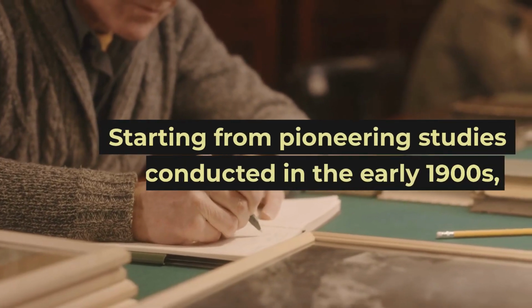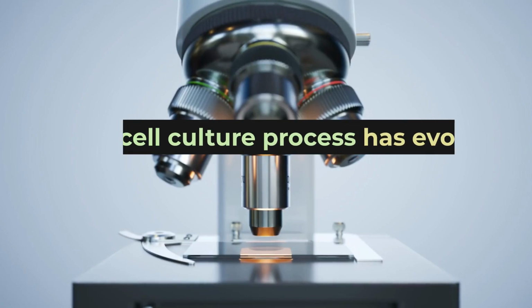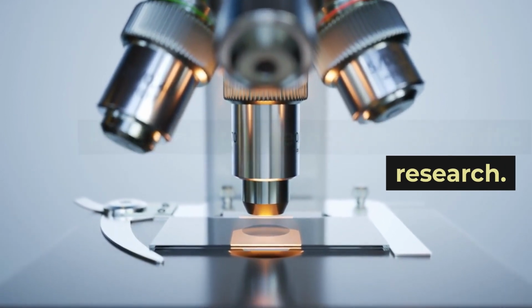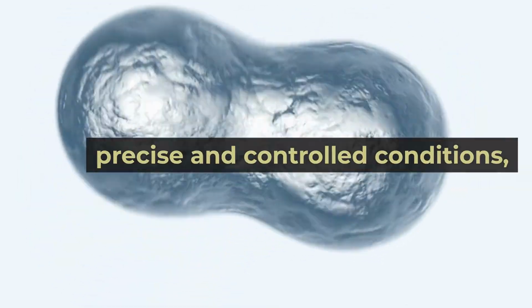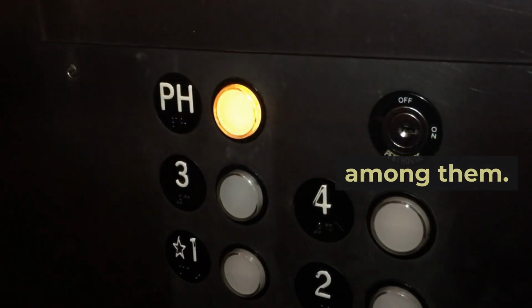Starting from pioneering studies conducted in the early 1900s, the cell culture process has evolved into one of the most widely used experimental methods for scientific research. Cultivating cells is a complex procedure that demands precise and controlled conditions. Pressure, temperature, and pH levels among them.